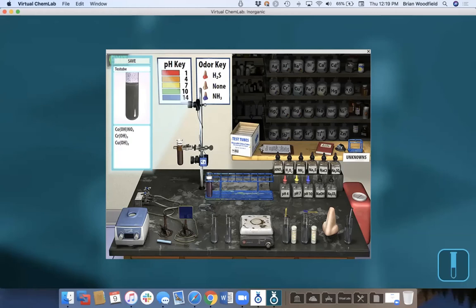And then I can go to, say, sodium hydroxide. Notice I added sodium now to my cation list because I added sodium hydroxide. If I do a flame test, for example, now you're going to see the sodium flame. I can centrifuge that. I can notice that chromium went into solution just because it's amphoteric. So I can decant and separate that. Now I'm left with my cobalt and my copper.